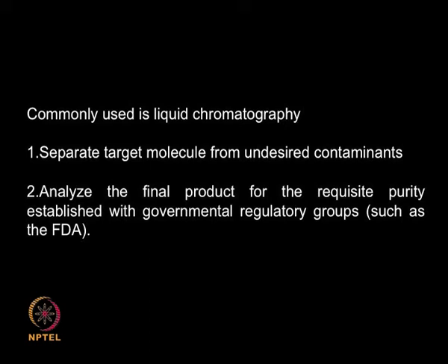We use liquid chromatography for separating target molecules from undesired contaminants, or we can use liquid chromatography for analyzing the final product and see whether the requisite purity has been reached with respect to certain regulatory conditions like FDA, that is the Food and Drug Administration stipulations.